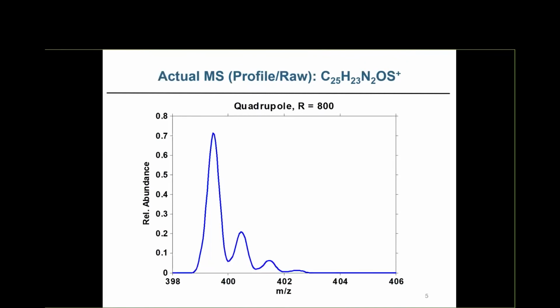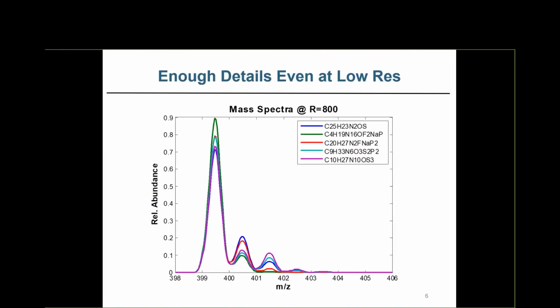So the interesting thing about mass spec, of course, as we all know, is that when we have an accurate mass machine, we can use that to help identify a formula because every single unique formula in the world has a unique mass, although sometimes obviously those differences are quite small.